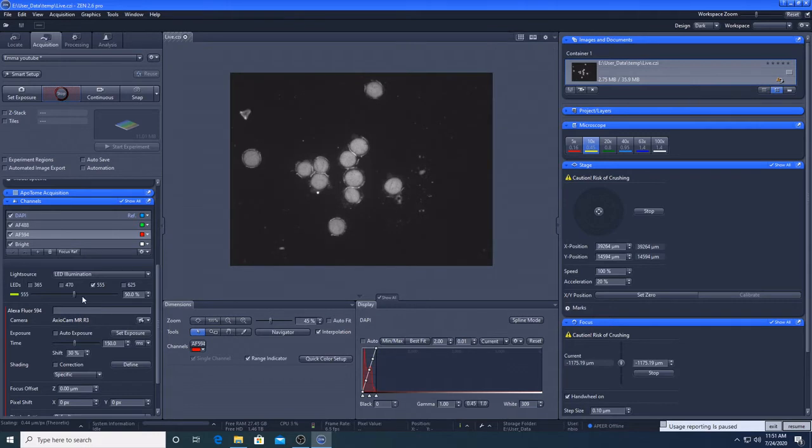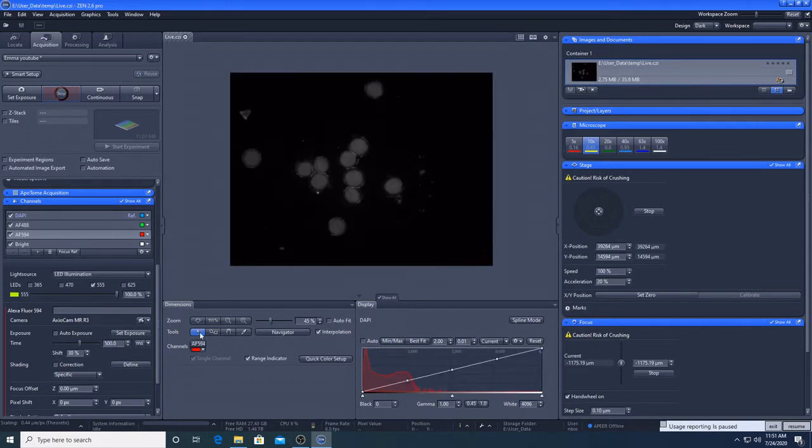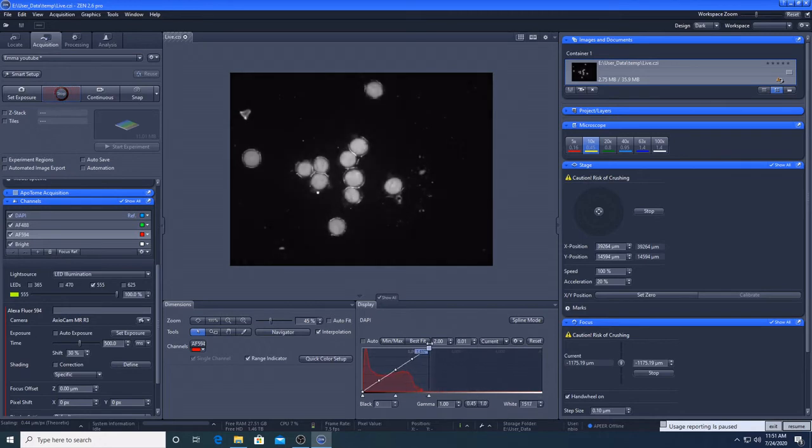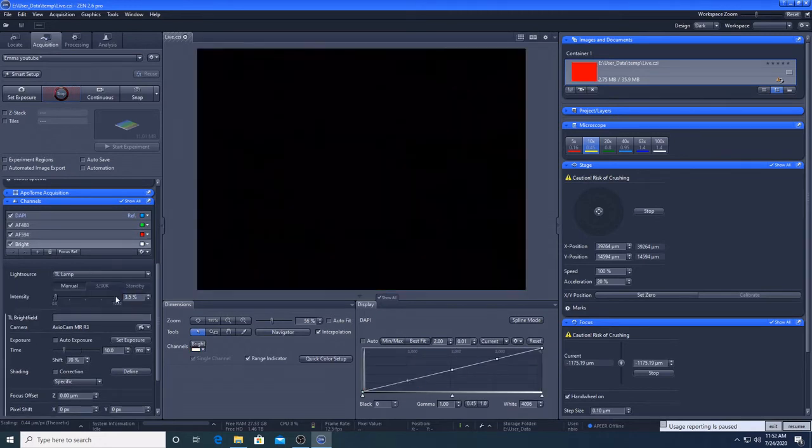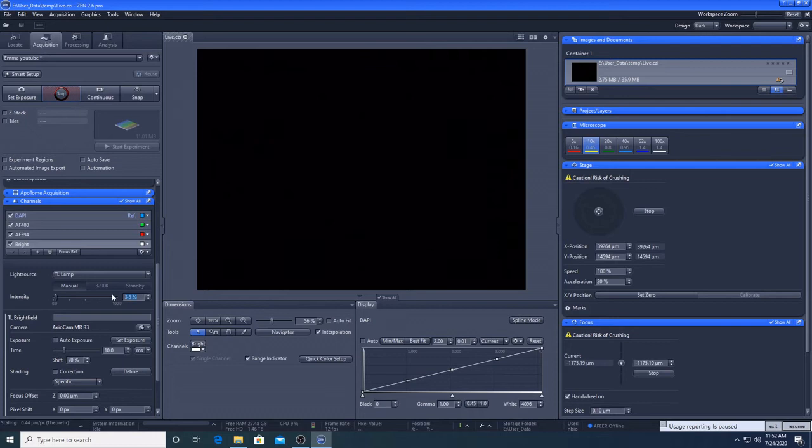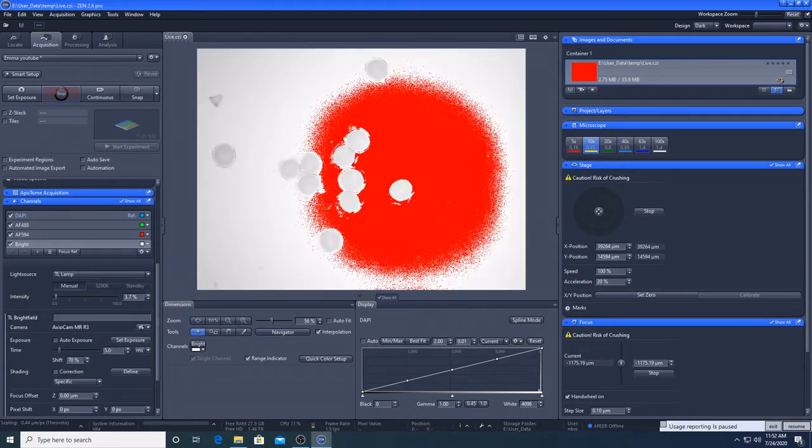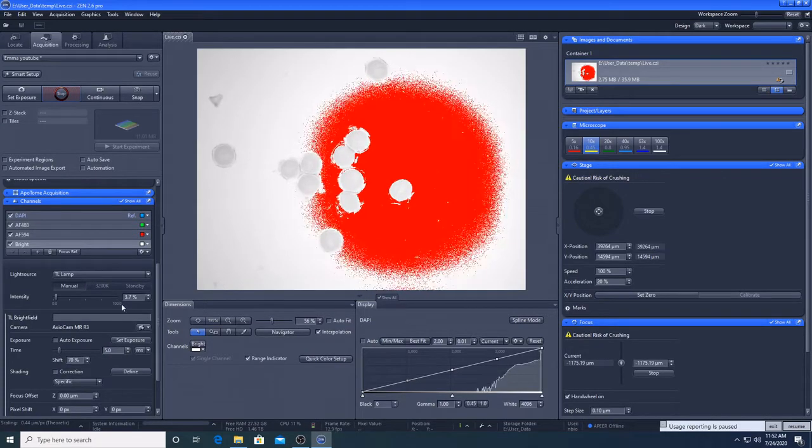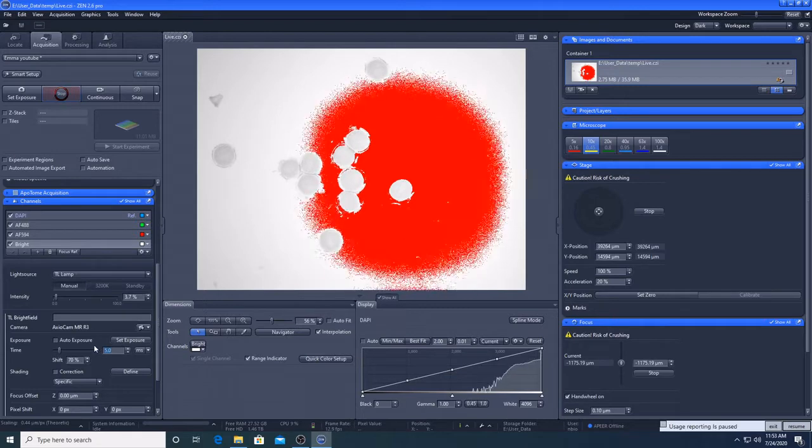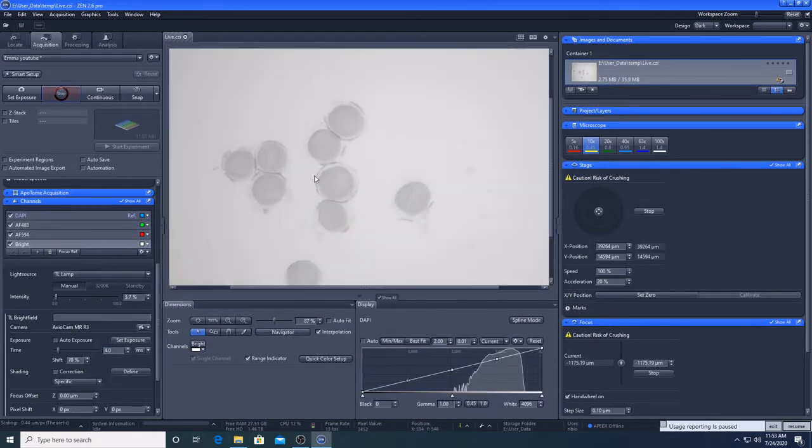This channel can still be optimised, so I will do that now. We will now optimise the Brightfield channel. As we saw from the light path diagram earlier, Brightfield uses a different lamp, which needs to be at a setting of over 3.8 for it to come on. We will adjust the exposure time in the same way as before. We can expect the required exposure to be much shorter than for our fluorescent channels.